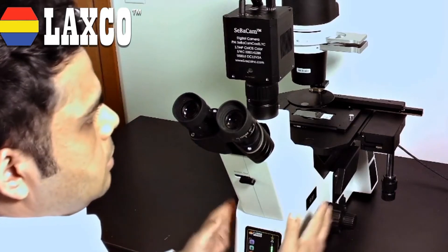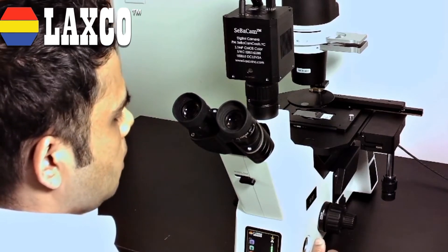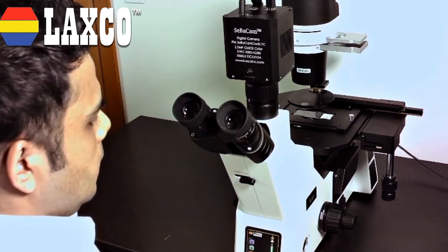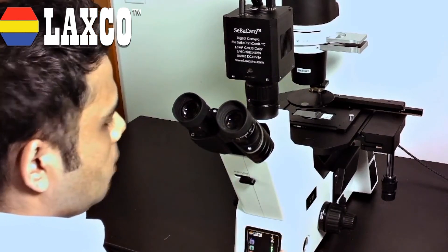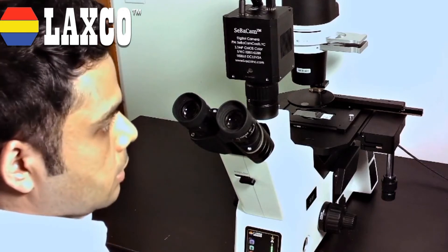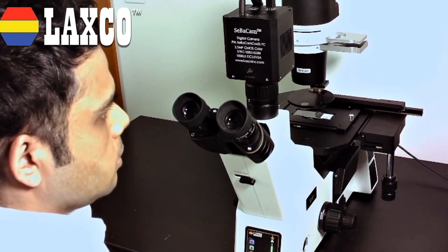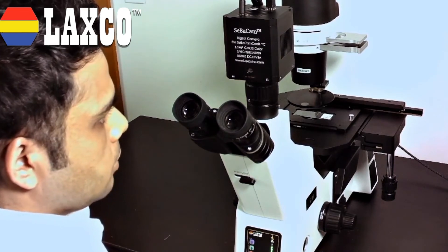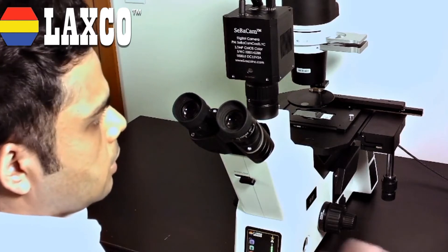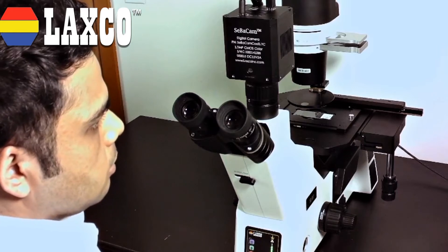This system is fully loaded with a multi-channel fluorescent system. Let's quickly look at the front touchpad. This touchpad allows you to do multi-channel fluorescence imaging at the click of a button. There are no moving parts. You don't have to move any levers. You don't have to switch between channels using a turret. Gone are those days. You only have to press a single button and then you go into multi-channel.